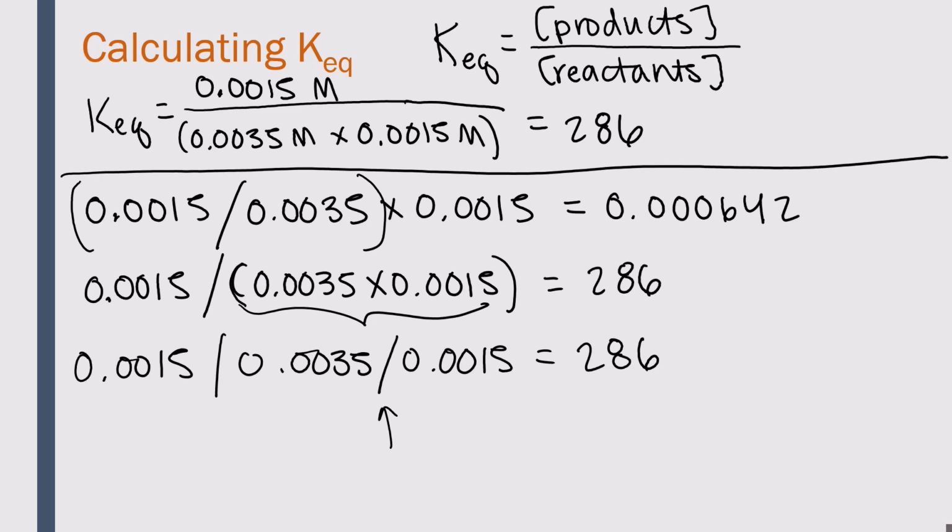Now, the last thing that we need to talk about is that when you're entering your answers in on Canvas, Canvas is very picky and it doesn't let us give you a range of numbers in the format that we've chosen for your lab experiment. So what you have to do is be really, really careful with your significant figures. So if we are using two significant figures for this problem, typing in 286 would not get me the right answer.